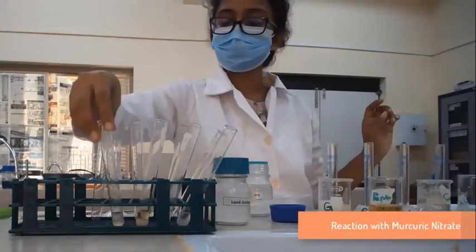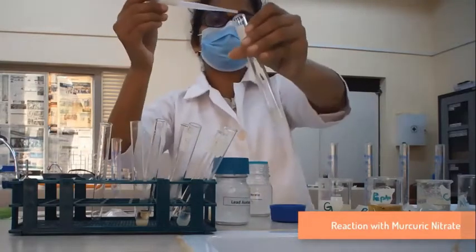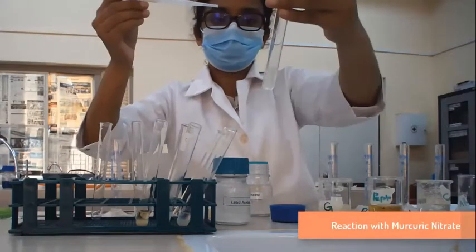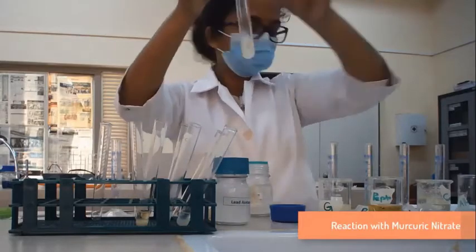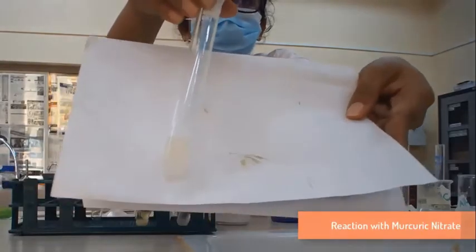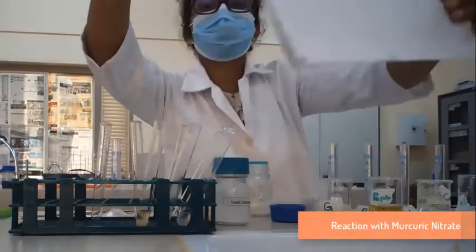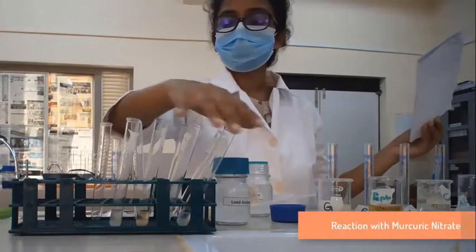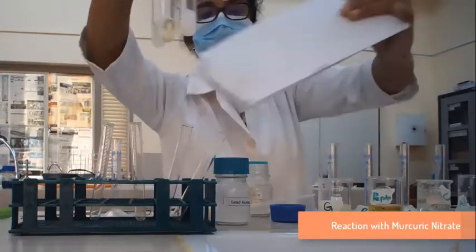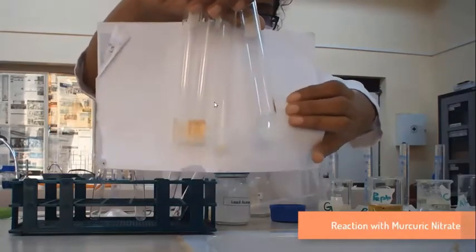Then finally, we are using gelatin and we are going to add a few drops of mercuric nitrate. And here also, you may observe a precipitation. You may have seen that all these test samples gave a precipitation with the mercuric nitrate.